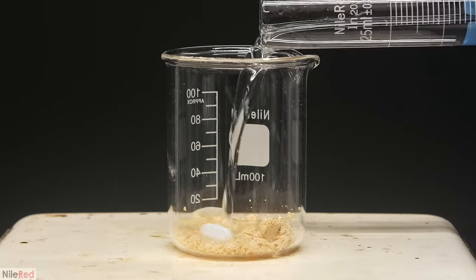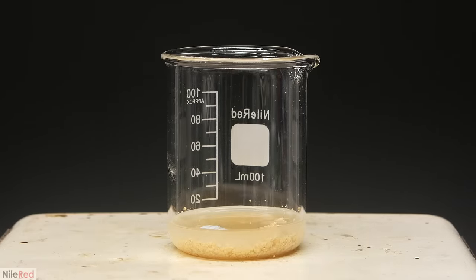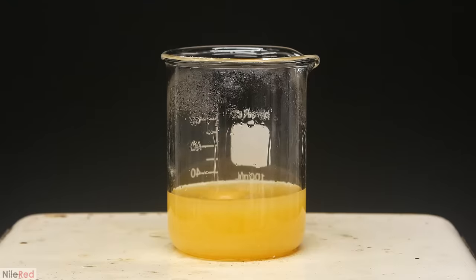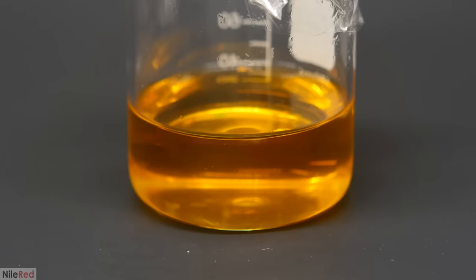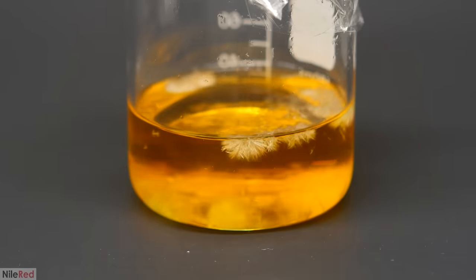On top of it, I added a stir bar and some ethanol, and I turned on the heating. I then kept adding more in small amounts, until it was all dissolved. I took it off the hot plate, and as it cooled, some really nice white crystals formed.